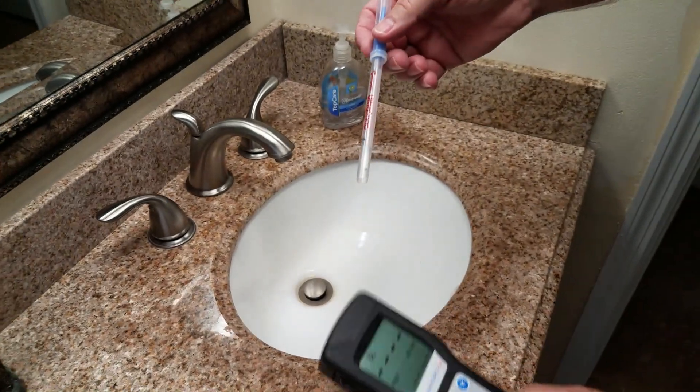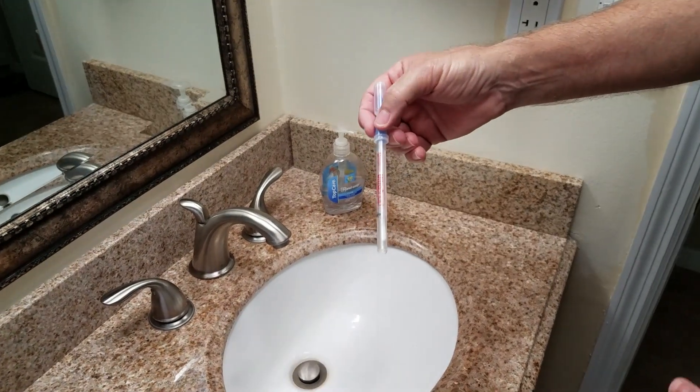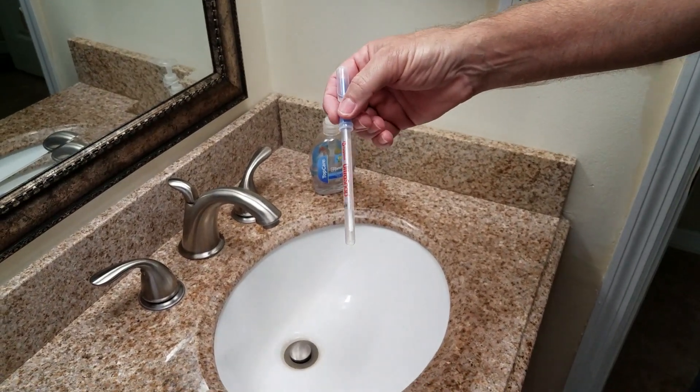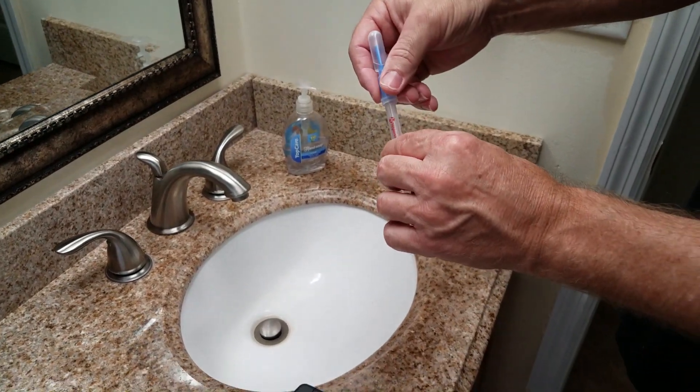We're going to do an ATP test to show some cleaning products that kill germs and viruses. The second product leaves a film on the surface to kill germs and viruses for 60 to 90 days.